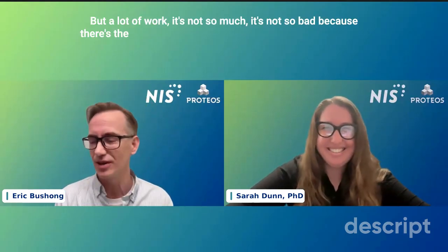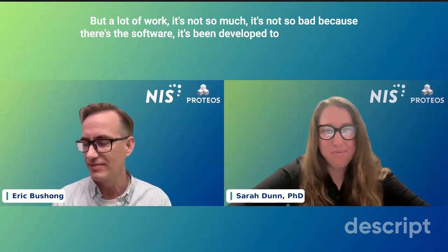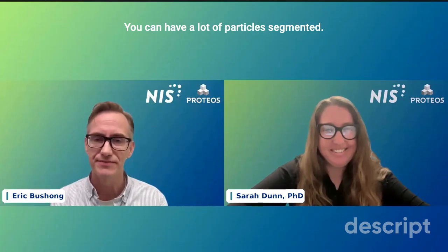It's not so bad because the software has been developed to minimize the pain. It's come a long way for sure. In a few hours, you can have a lot of particles segmented.